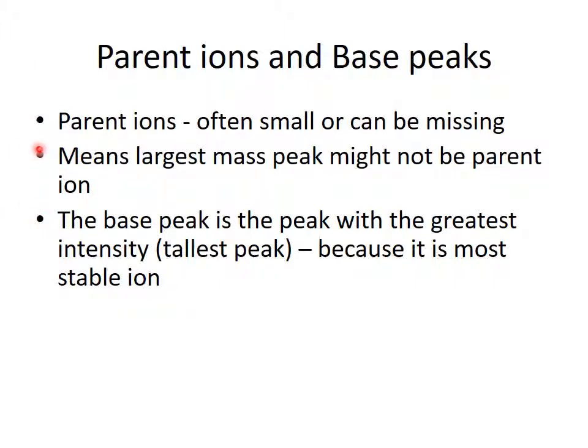But in the future, if you were to go on in this area, realize that the molecular ion is sometimes missing. And that occurs when there's a real stable carbocation that can form and the parent ion just decomposes really quickly, so it's never detected.